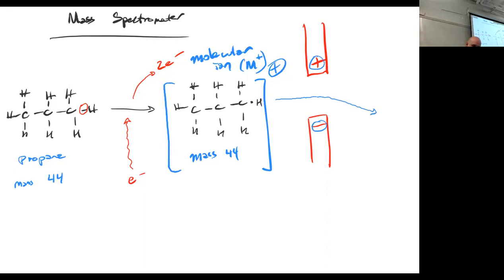And what we will have at the other end of this is a detector. Much like most instruments, we have something that happens or changes with a sample, and then you detect what comes out the other side. In our detector, we can actually detect where each individual ion strikes the detector. And so if it strikes there, or there, or there, we can measure that. That's practically what's going to come out as the mass spec: what different ions hit the detector at different places and how many.